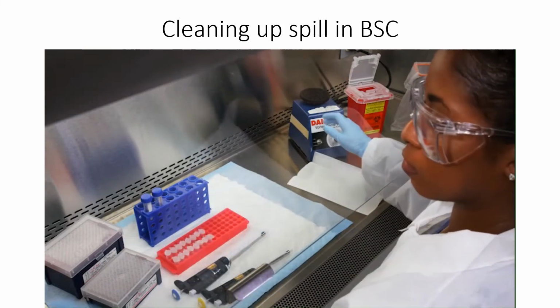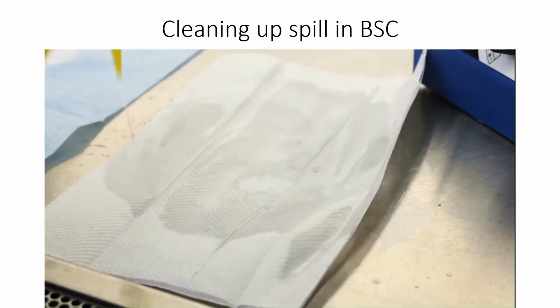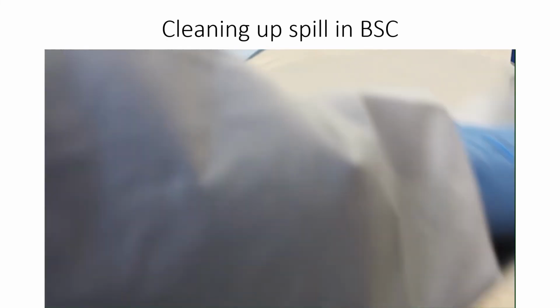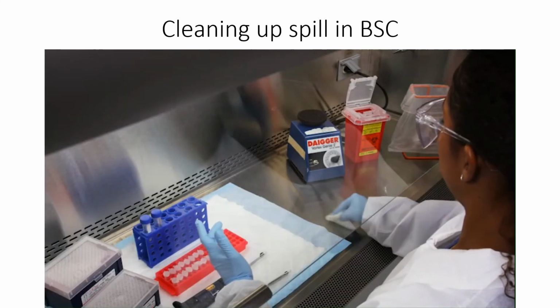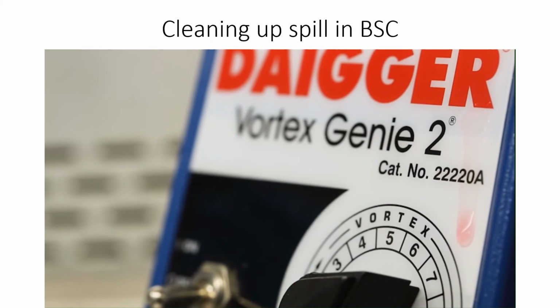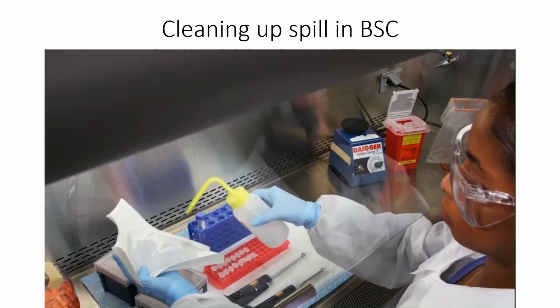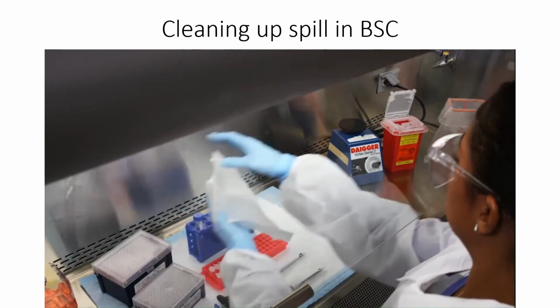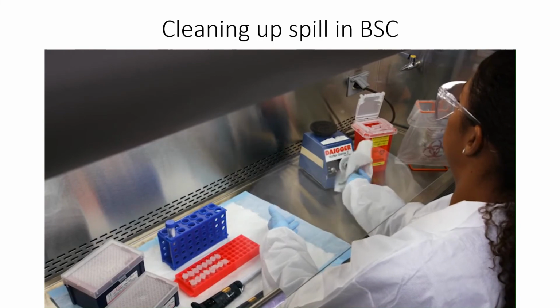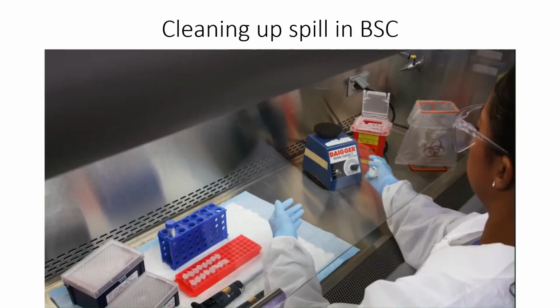If bleach was used, swipe the surface with ethanol or water to remove the residual bleach and prevent pitting of the stainless steel. If objects inside the BSC came in contact with the spill, they must also be decontaminated. Apply disinfectant to paper towels and wipe the exterior surfaces. Make sure the objects are wetted for the proper contact time before resuming work.